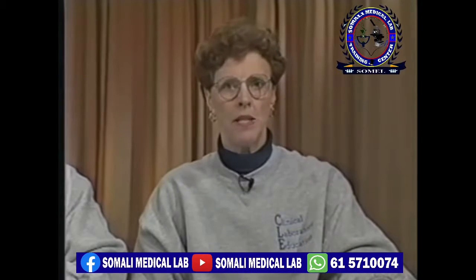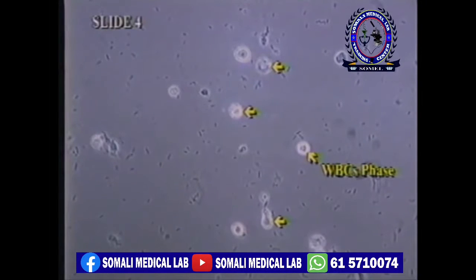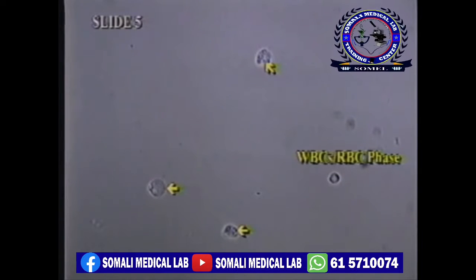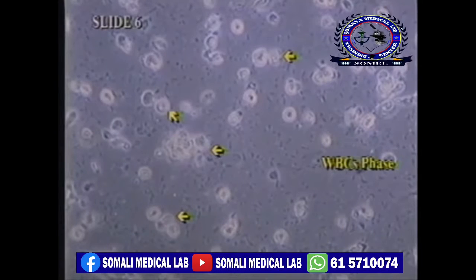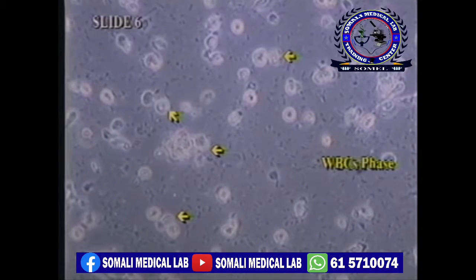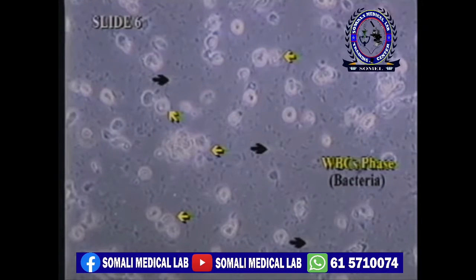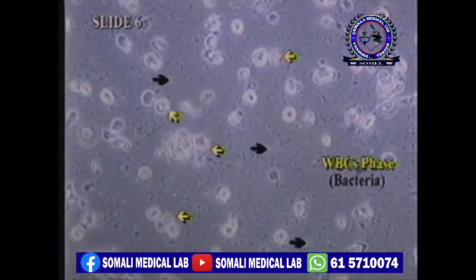Now we'll look at some white cells. In this slide, there are quite a few seen, again under high power phase. In this slide, under phase, you can see 3 white blood cells and a single red blood cell. You can see the obvious difference between red blood cells and white blood cells. In this slide, there are lots of white blood cells, and although we are not there yet, there is also a significant amount of bacteria. This combination is pretty common.